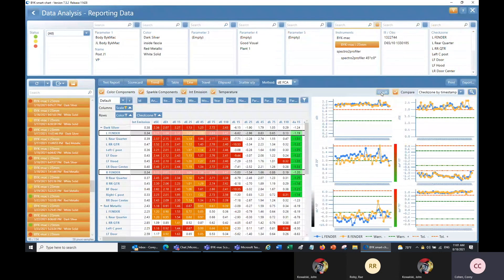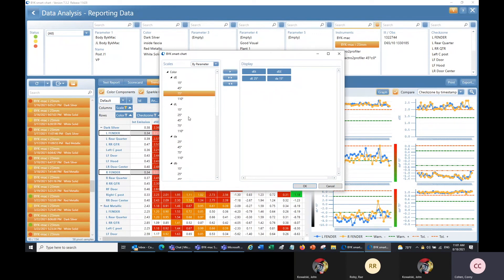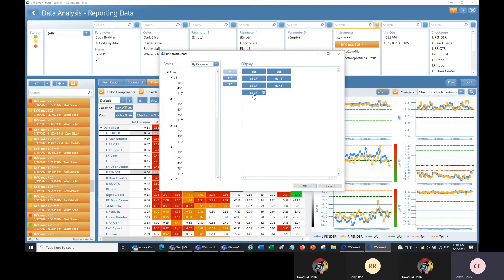I can click on graph to select the scales I want to see and organize them the way I want. I can remove scales by clicking the trash can symbol, add scales from the left by clicking and hitting the arrow, rearrange the order by dragging and dropping, and change the format.